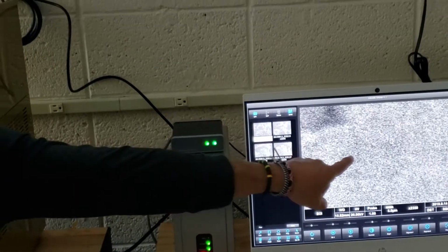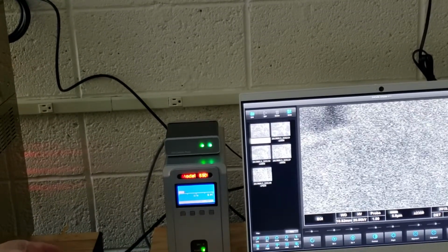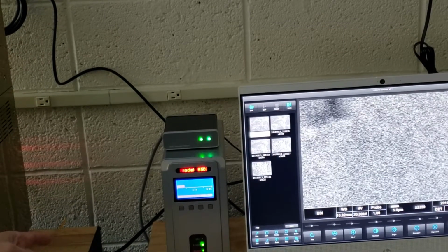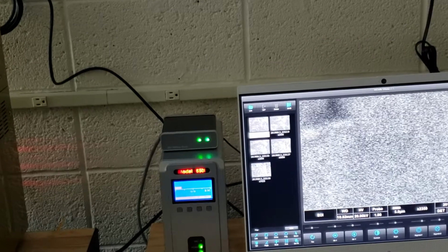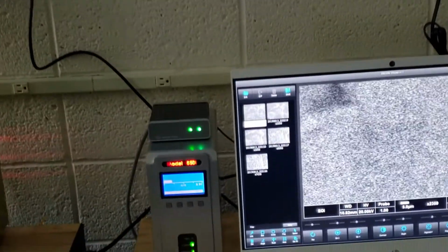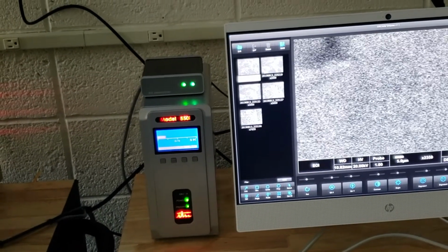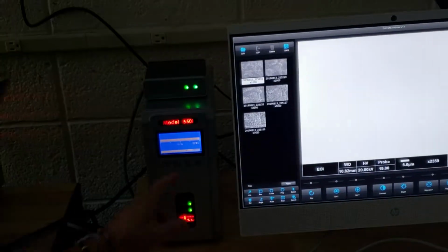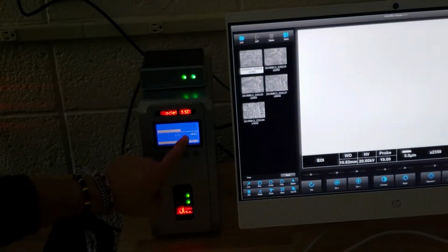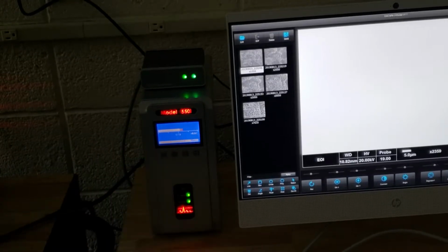If you don't see a beam here, and this guy's moving, there's a beam in that column someplace. And if we're not getting a good X-ray count, then we say, what's wrong? You look at your counts, they're only 300. Then you'd be like, I need to move my probe current from 1, or increase my spot size. That's what probe current is, spot size. I'm moving my spot size from 1 to 19, and I look at that scale from 1,000, 2,000, went up to 4,000. It auto scales, and roughly we have almost 3,000 counts a second.